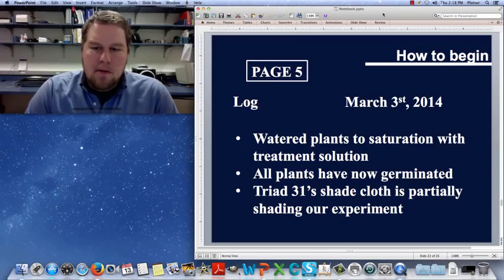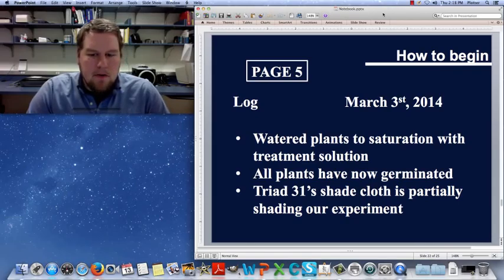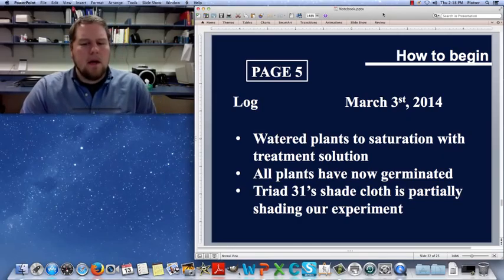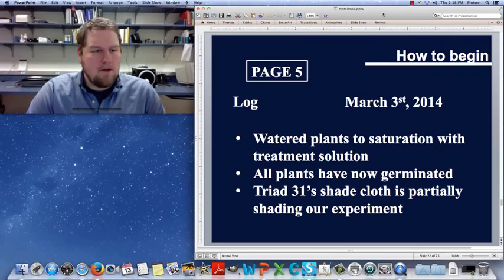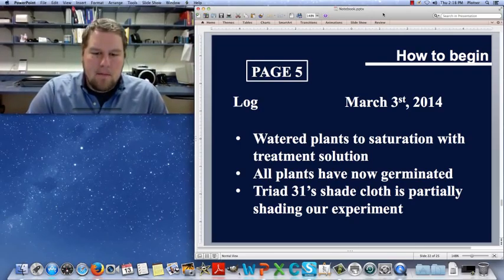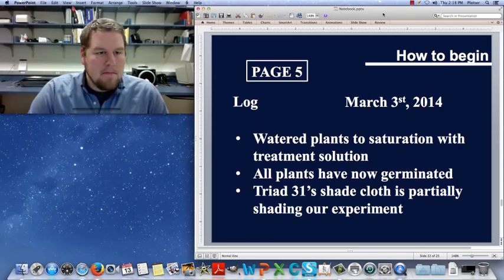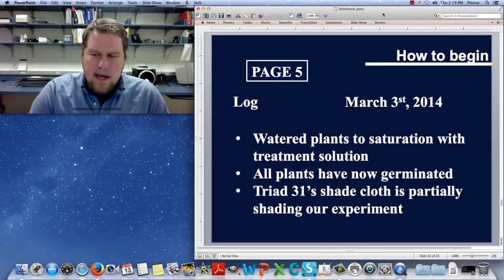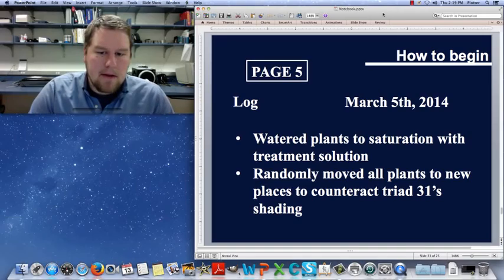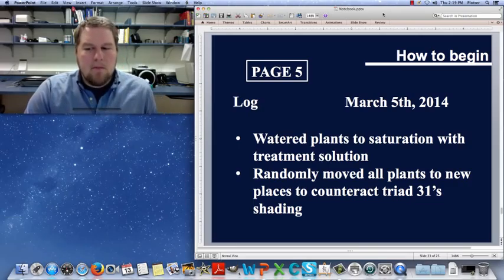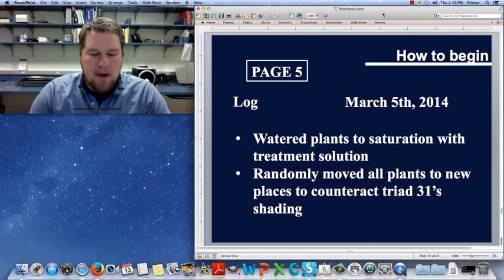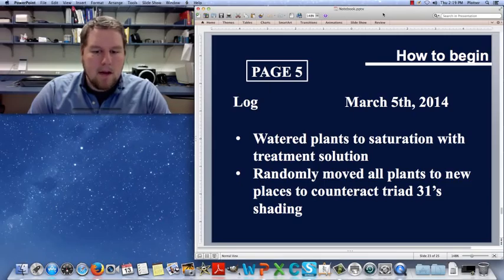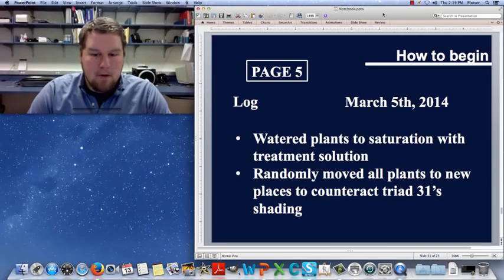So I go back in on March 3rd. I water again my plants with my treatment solution, and I notice that now all the plants have germinated. There are seedlings in each pot. But I notice also that the triad adjacent to me, triad 31, their shade cloth is partially shading my experiment. And I'm a little concerned about that because not all of my plants are receiving the same amount of light now. So I kind of went home that night and I thought about what I could do. And I came back two mornings from then, and March 5th I watered my plants. And then I randomly moved my plants to new places because I knew that the shade cloth would introduce another factor in my experiment, so I wanted to randomize my plants in space to counteract that shading that my neighbor triad was doing.